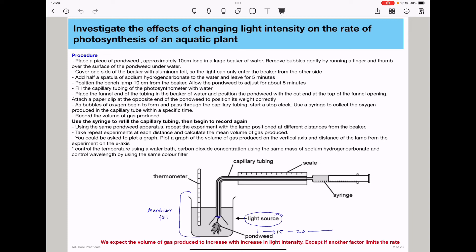And we also need to control the wavelength. We can do this by using the same color filter. It means for all experiments, you will put a color filter in between the light source and the experimental setup so that the pondweed is exposed to the same wavelength throughout the experiment and for all variations of light intensity.